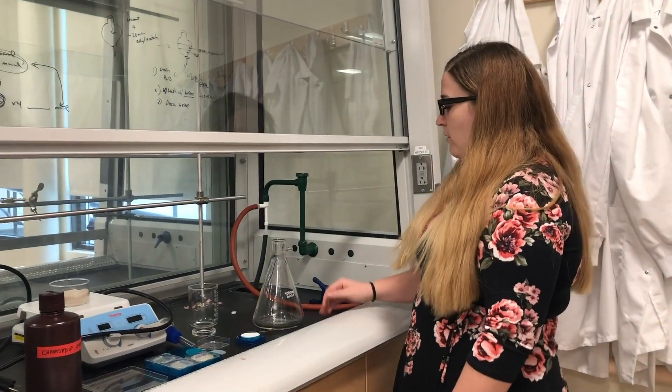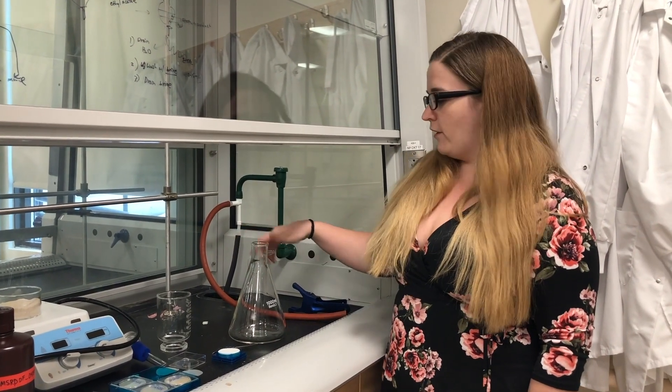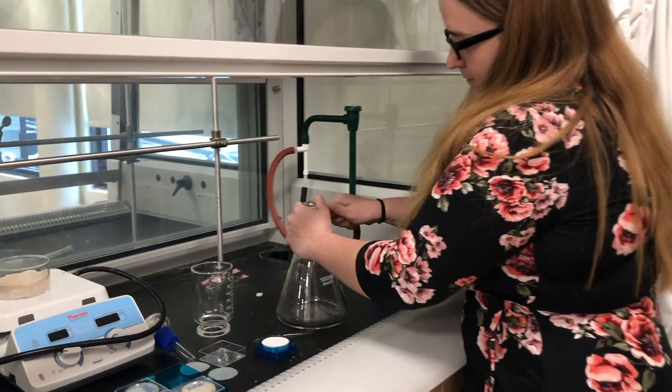Here are samples. We need to set up a vacuum filtration. We're going to use the thousand milliliter filter Erlenmeyer flask. First you want to hook it up to the tube and then get your filter ready.